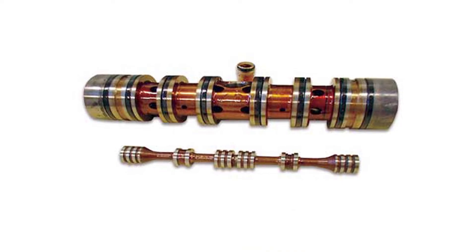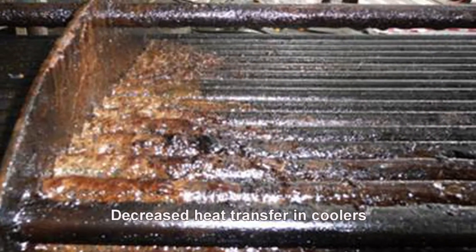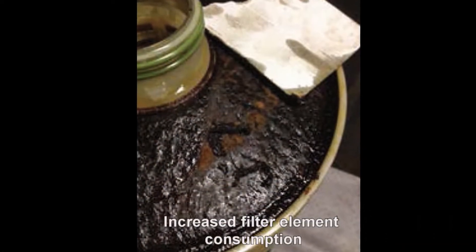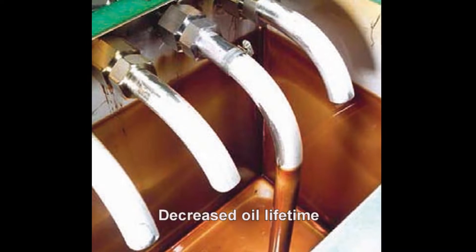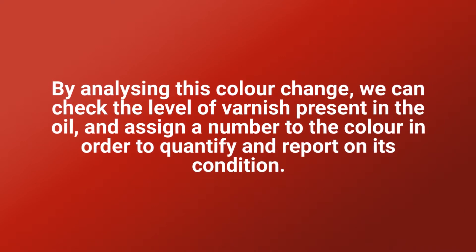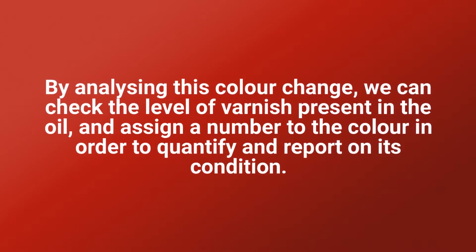Increased temperatures on bearings, decreased heat transfer in coolers, increased filter element consumption, decreased oil lifetime. By analyzing this color change, we can check the level of varnish present in the oil and assign a number to the color in order to quantify and report on its condition.